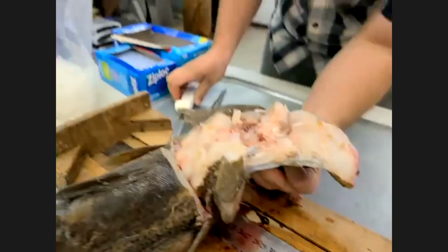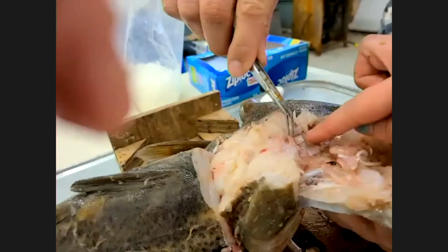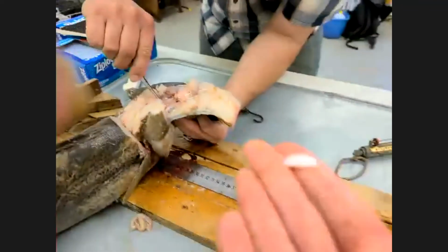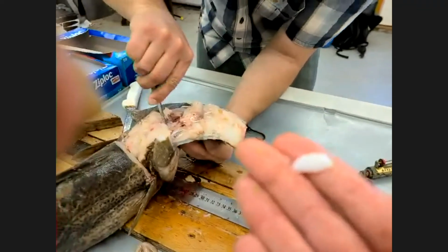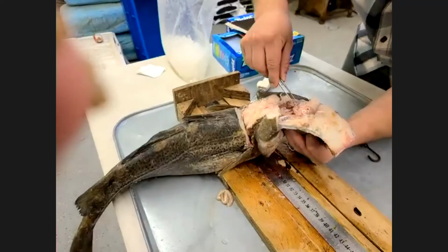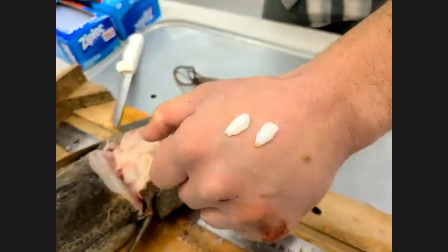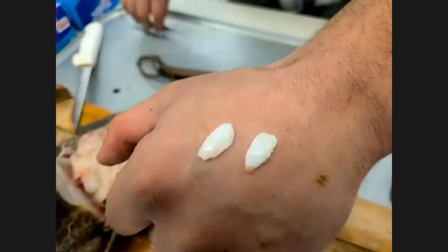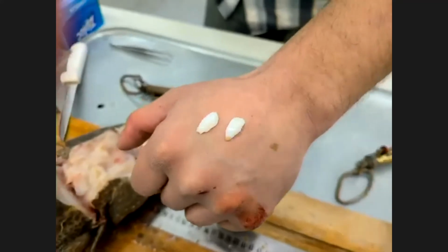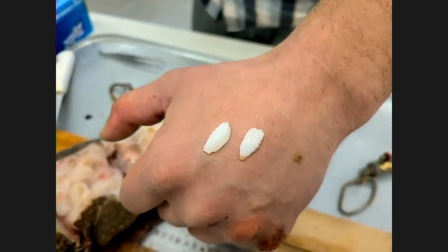So we get into here. So this is an otolith. And otoliths are found in all bony fish species, so not in things like sharks. But they're really cool because when you cut into them, they have these rings, like rings on a tree. And by counting the rings, you can age the fish, which is always like my favorite fact because it sounds like a joke. But these are really important because we can link things like age to length and age to weight and age to maturity, all of these other things that we've been looking at, which are really, really important things to know because this is the only way to age a fish.